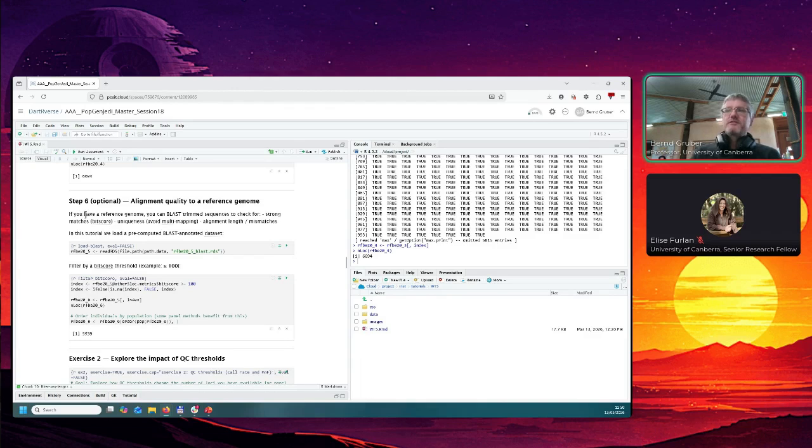What you can do is, if you have a reference genome, you can blast your SNPs against the reference genome, and you want to have ones that have a high bit score. It means they match really well to the reference genome. You know where they are, and the sequence is something you can trust. Very important for your SNP panel, and therefore you want to have that.